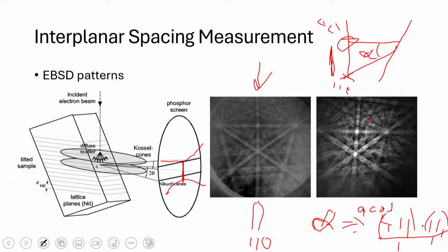Okay, so we've said it's the silicon calibration sample. So we know this band that we've identified here is a 110 band. We know that this pole that's going to come and meet up here is the 100. And so then by a knowledge of what the crystal is, you can come down and say this one is 411 at this point.